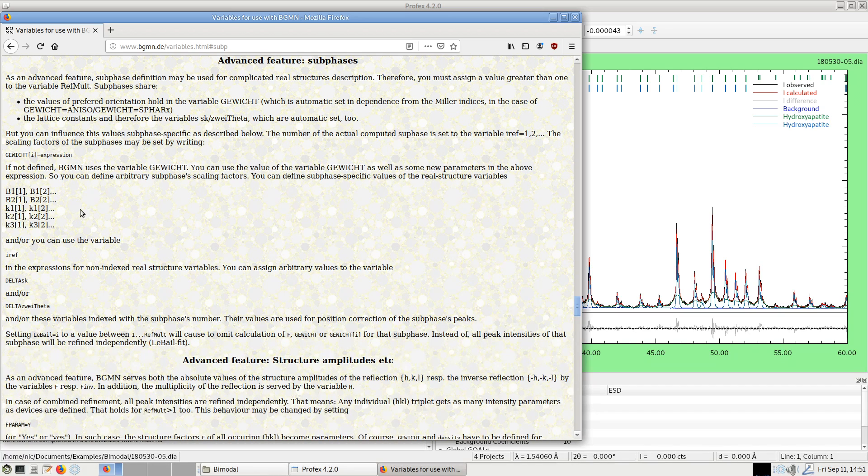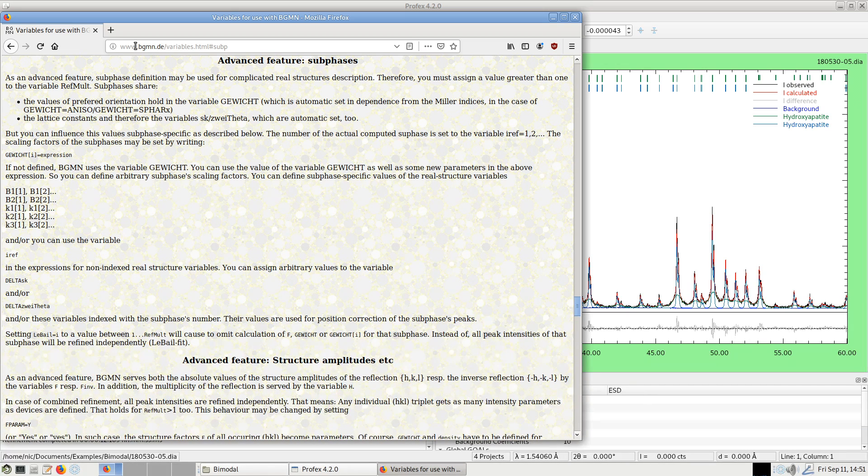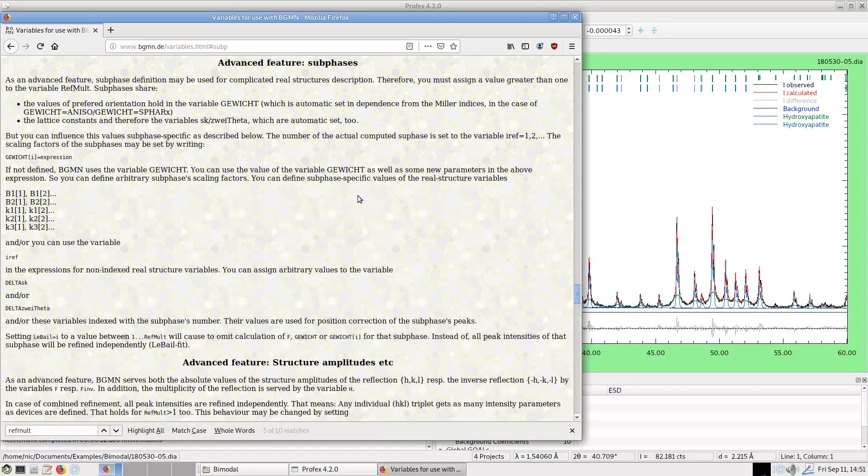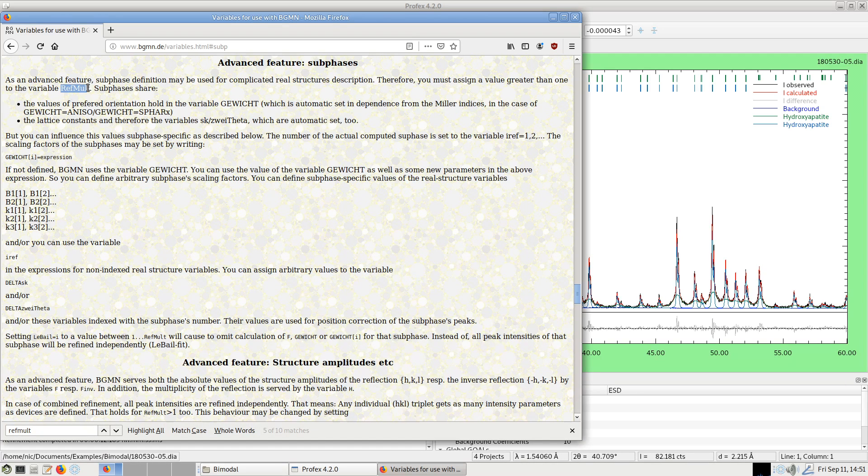So instead of only refining one parameter for crystallite size related peak broadening, we can refine multiple of them. And we activate sub-phases with the keyword refmult. This one here.